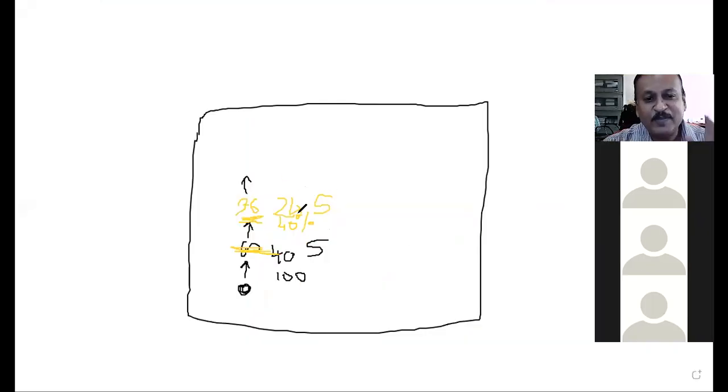Now what I am telling you here is this 40% of the solute molecules are still there on the stationary phase. Now, when the new mobile phase comes, shall I show it with a different color? I'll try to. So when the new mobile phase comes here, it is again going to push the 40% of the solute molecules which are there on the stationary phase. And then what will happen?